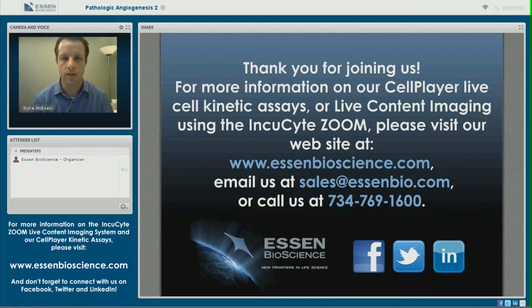The ECFCs that we use are generated from umbilical artery cord blood. The cord blood is isolated, and the cells are grown out, and the isolated colonies that are positive for CD31 are then what develop into the ECFCs.